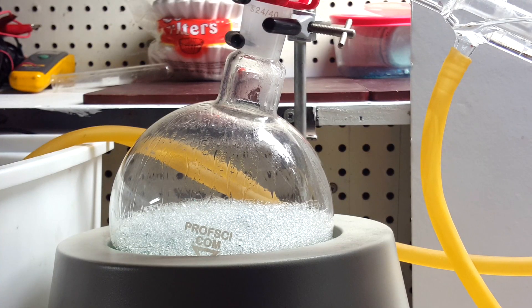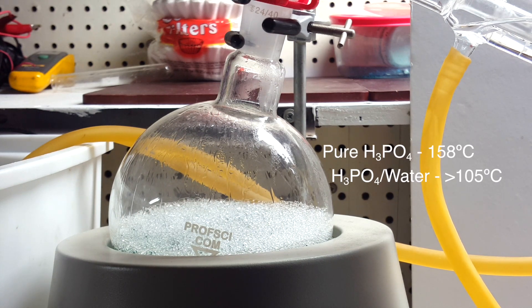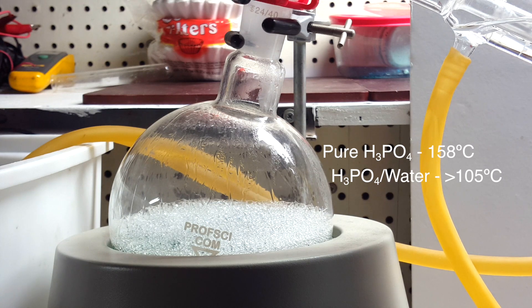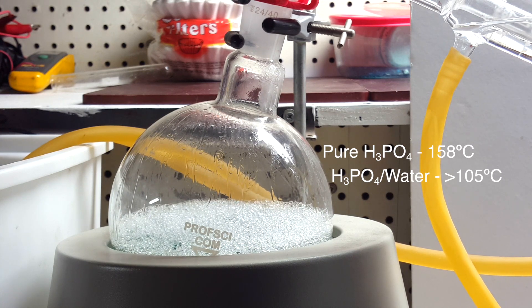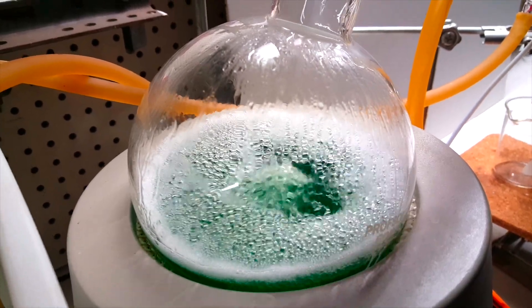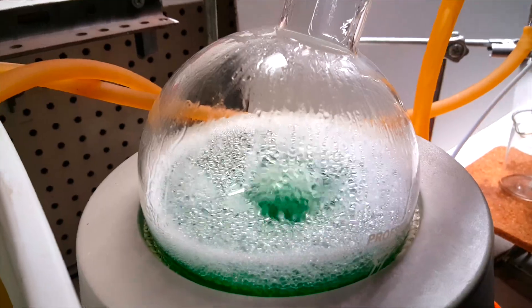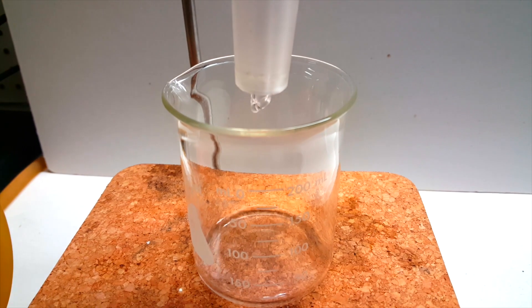Eventually, some vapor started refluxing on the sides of the round bottom. Pure phosphoric acid has a boiling point of 158 degrees Celsius, but solutions of water and phosphoric acid can boil over together at as low as 105 degrees Celsius. After quite a while, the solution began to boil and foam quite excessively. Regardless of this, I began to collect a nice and clear distillate.